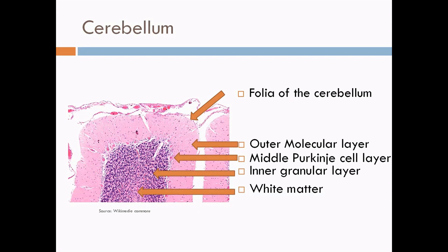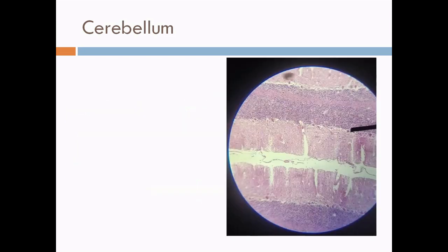This includes the mossy and the climbing fibers and the axons of the Purkinje cells. The outer molecular layer is made up of the dendritic arborizations of the Purkinje cells. We can also see stellate cells and basket cells in this layer. It is also called the plexiform layer.